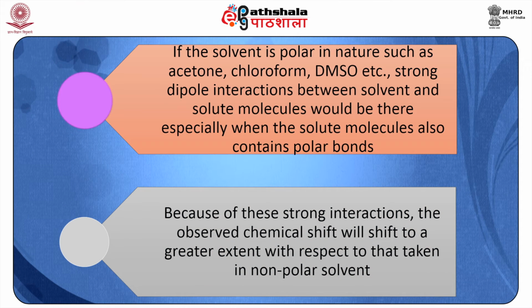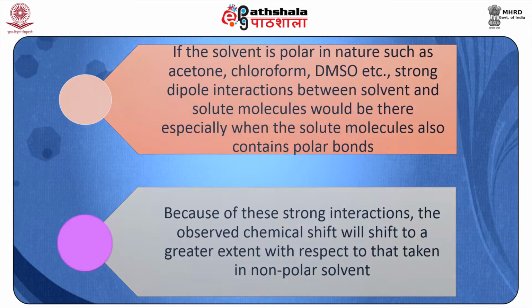However, students, if the solvent is polar in nature, such as acetone, chloroform, DMSO, etc., strong dipole-dipole interactions between solvent and solute molecules would occur, especially when the solute molecules also contain polar bonds. Because of these strong interactions, the observed chemical shift will shift to a greater extent with respect to that taken in the nonpolar solvent.